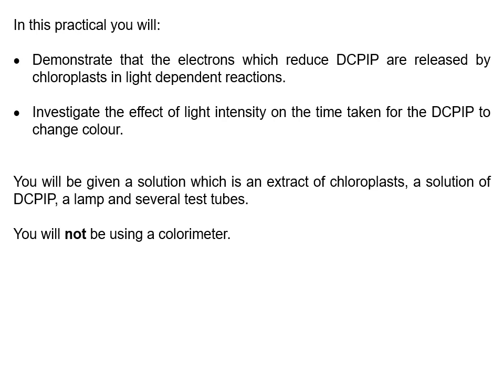Now in this, interestingly, although we are judging this reaction by a visible change in colour, we're not going to use a colorimeter. We are going to use our own judgment. So there is a lot of room for human error in this.